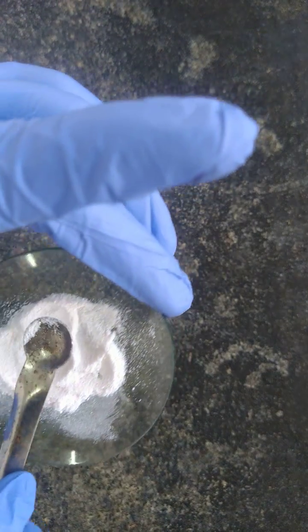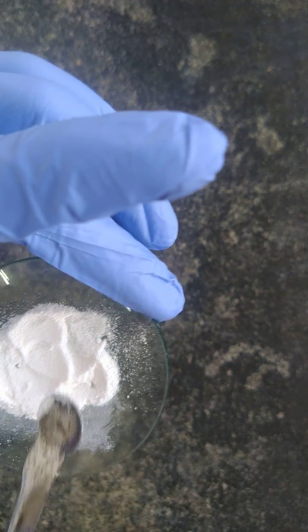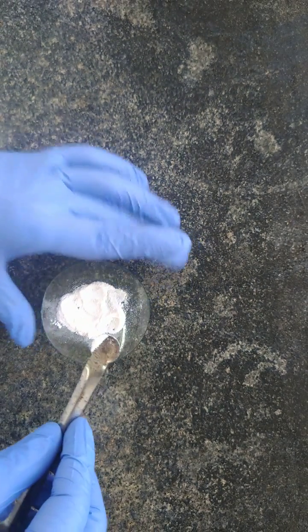If you observe, you will feel it as an amorphous salt, but what you do is take a pinch of the salt on your fingertips and rub it like this. You can feel the crystals.